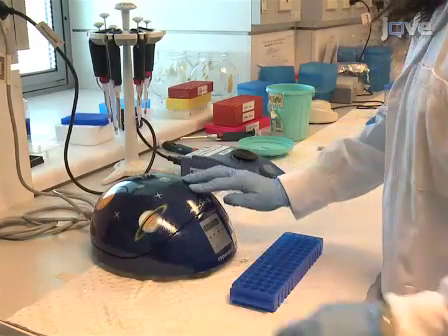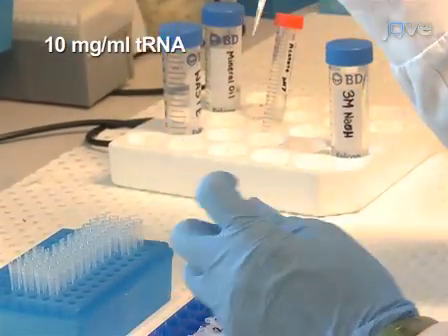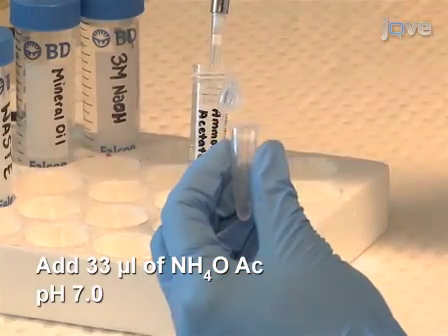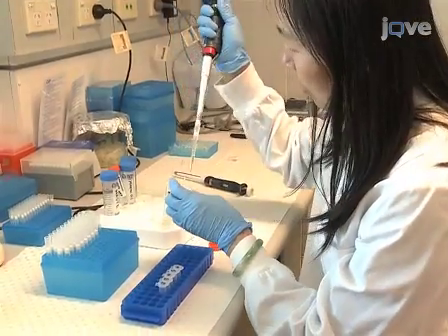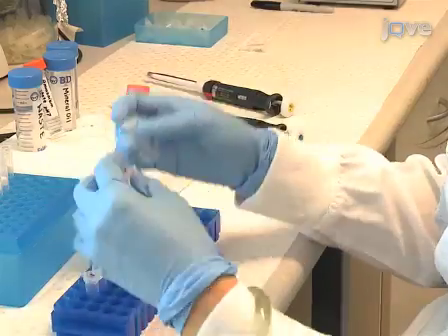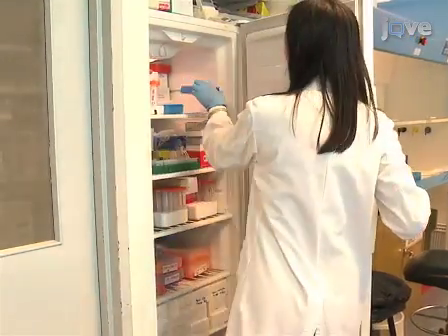Centrifuge the samples briefly and then add 1 microliter of tRNA to each sample. Neutralize the solution by adding ammonium acetate to a final concentration of 3 molar. Next, ethanol precipitate the DNA. Add ice cold 100% ethanol, 330 microliters, and mix well by inversion. Leave at minus 20 degrees Celsius for 1 hour to overnight.